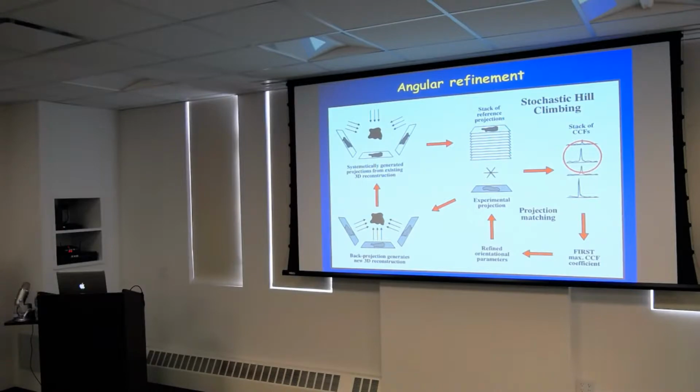And if your particle is actually symmetric on two ends, you have a correlation to, hypothetically. I'm not sure how it would affect it, but you always find it also with noise. Even if you have a perfectly symmetric particle, because it's noisy, it's not going to look terribly symmetric to the program that just looks at the numbers. Usually if you have symmetry, you don't look at the full angular space, you just look at the angular space that you need. So you speed it up.